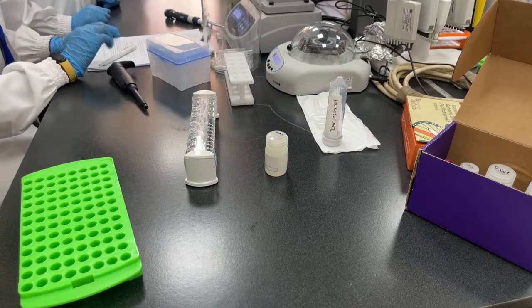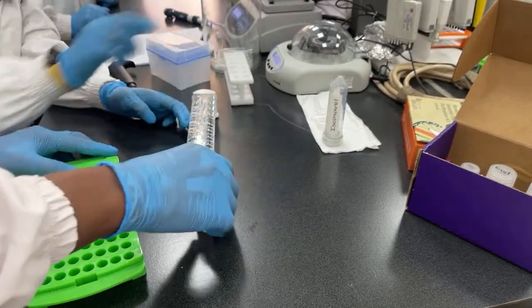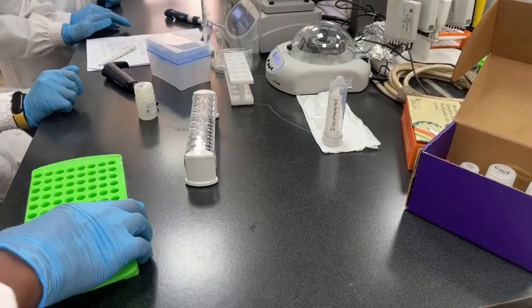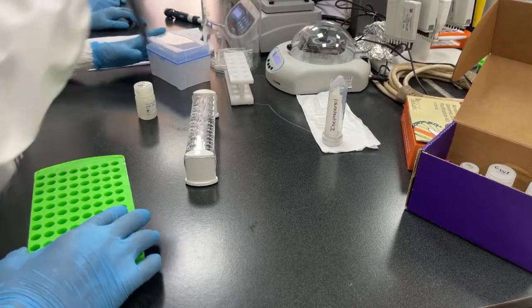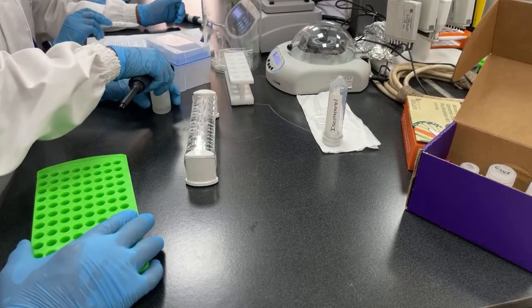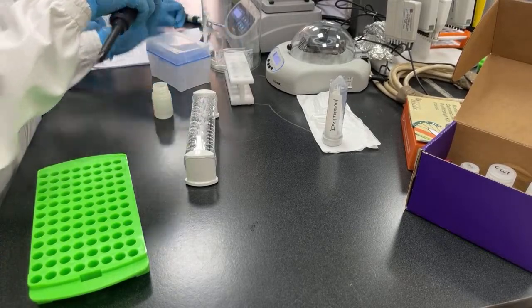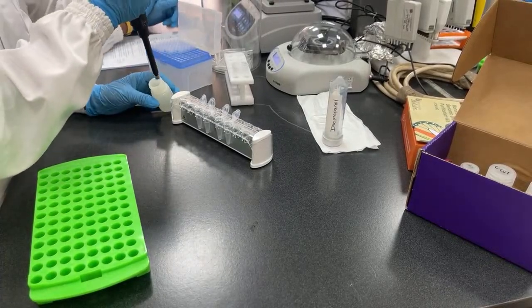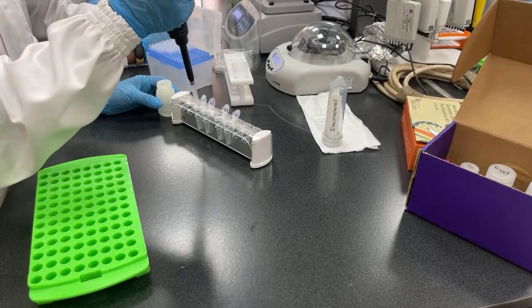Okay, I'm going to need someone to add CW2. I'm here. Give me space. And then the last one is done. Still 500 of CW2? Yes, 500. Long protocol, eh? Yeah, in the tube.